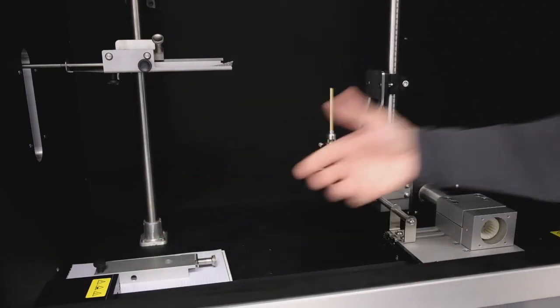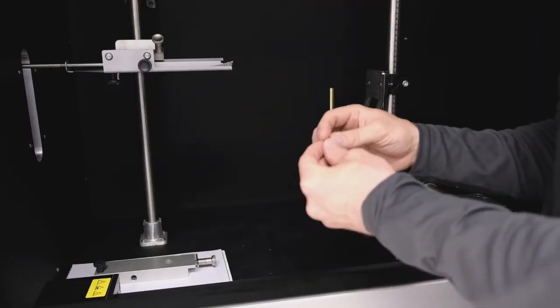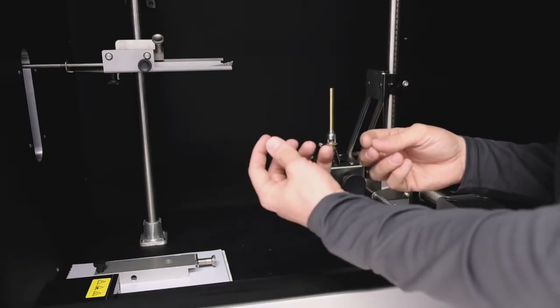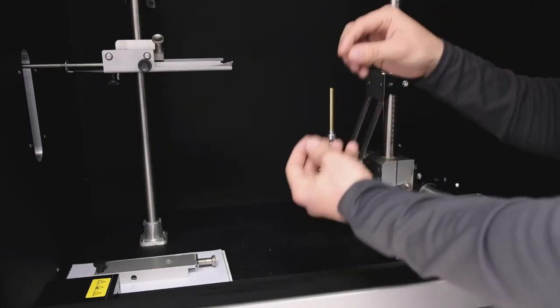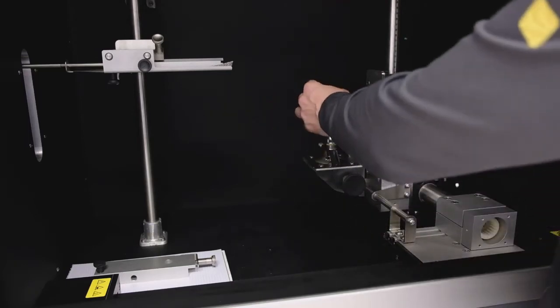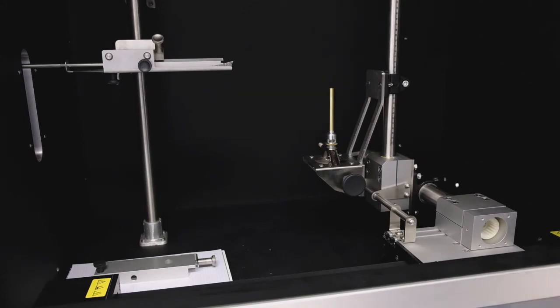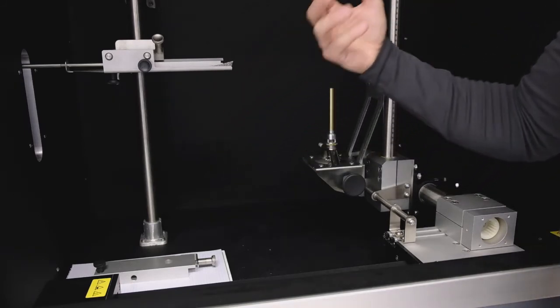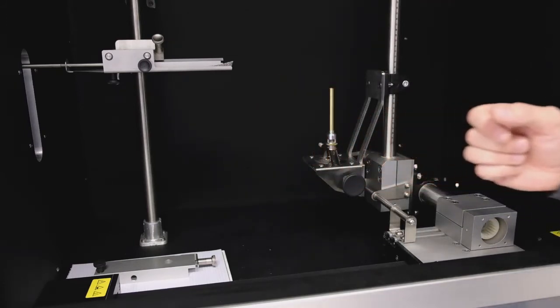The thermocouple for calibration is designed like a normal Type K thermocouple, and there is a specific metal block on the bottom of the thermocouple. The standard gives you all the dimensions and all the places where you have to put your thermocouple and where you have to put your burner. This is what you can do with the touchscreen itself.